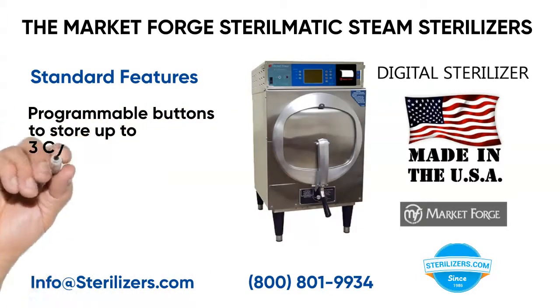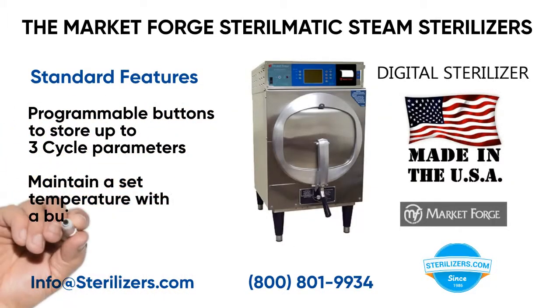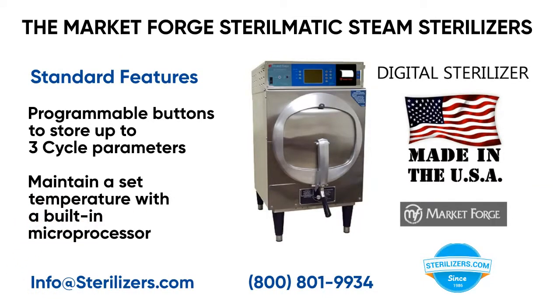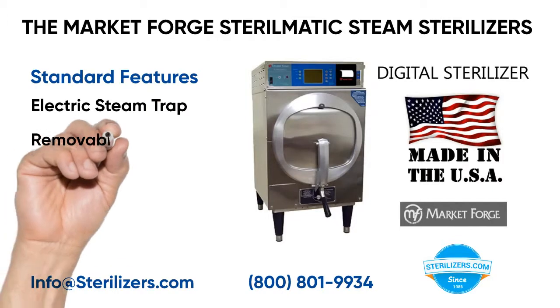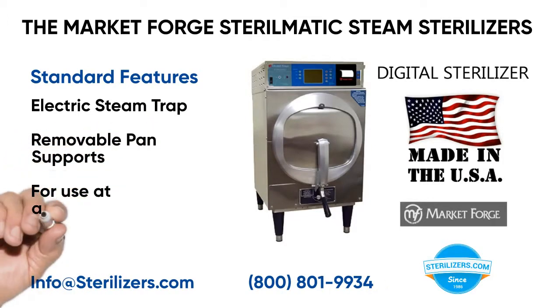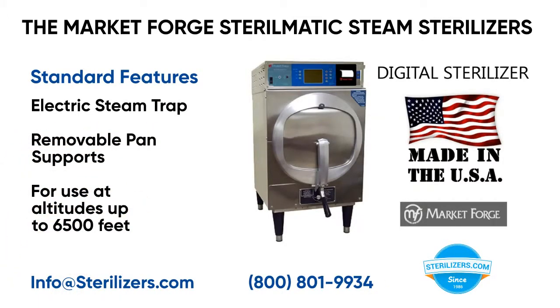Programmable buttons to store up to 3 cycle parameters. Maintain a set temperature with a built-in microprocessor. Electric steam trap. Removable pan supports. For use at altitudes up to 6,500 feet.